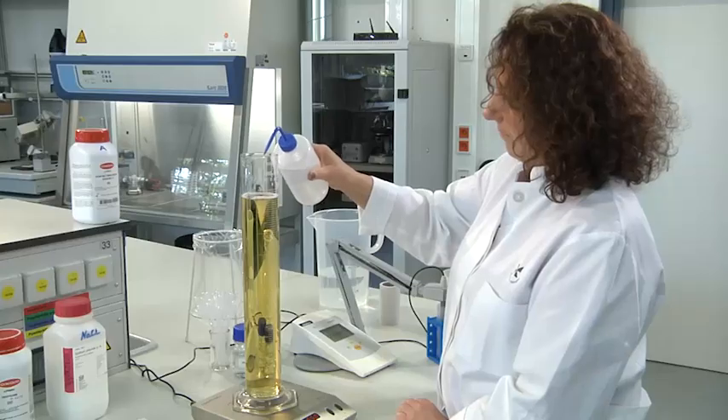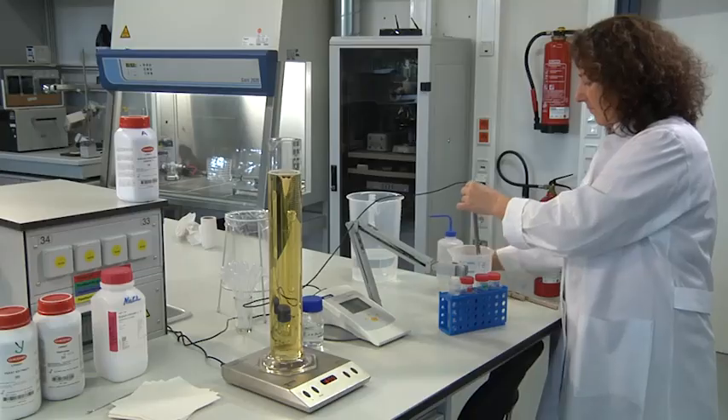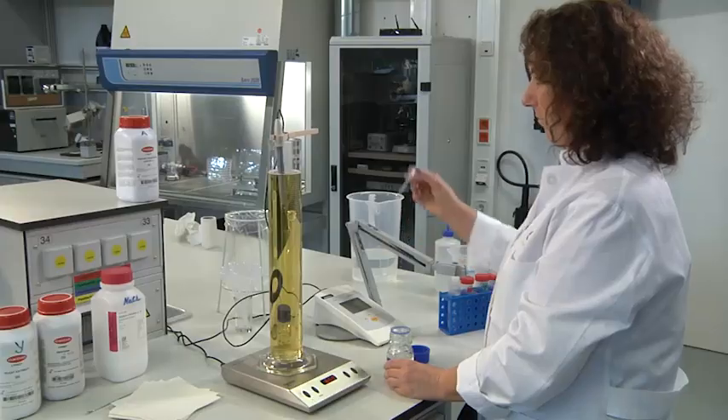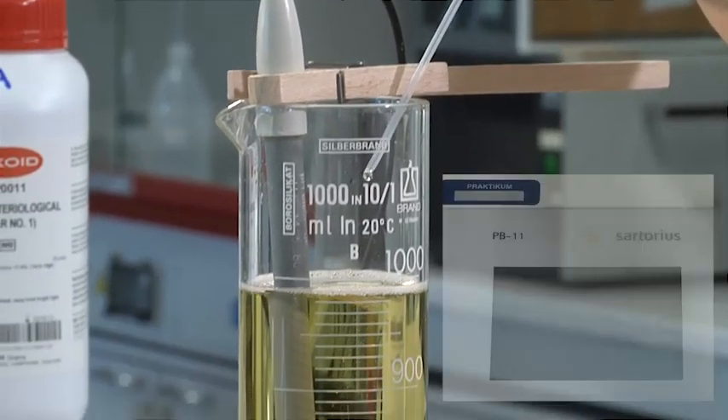When all added compounds are dissolved, add desalinated water to the final volume, and adjust the pH to the desired value using diluted aqueous solutions of either acids or bases, like hydrochloric acid or sodium hydroxide.